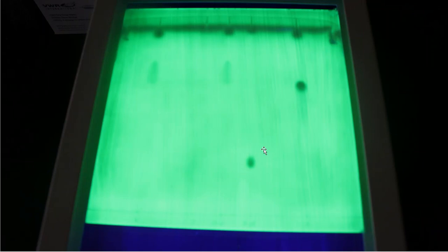So what I do while it's on the UV light box is that I take a pen, some type of marker, and I begin to mark and draw the areas that I see things, right? So it's very obvious that these are spots that I need to take in consideration. It also looks like I have a couple of humps up in here. I'm going to draw those as well. And then it also looks like I can mark my mobile phase on this line too. So I draw it across with a marker. Down here at the bottom, that's my starting line. So I can see that area show up, and I can draw that with a marker.